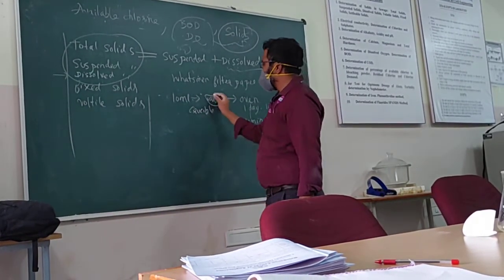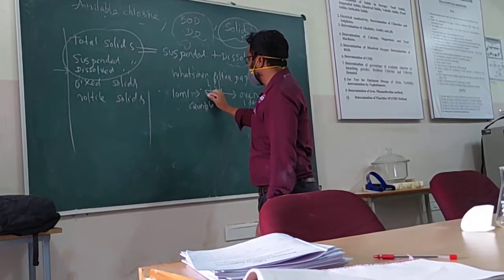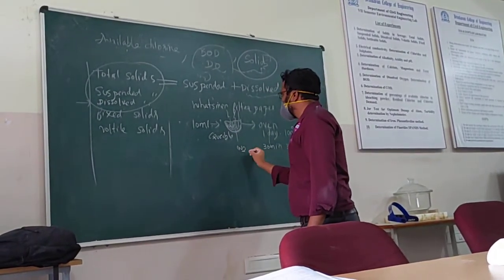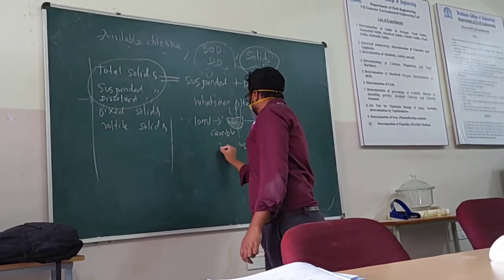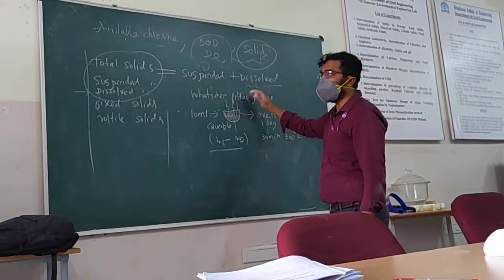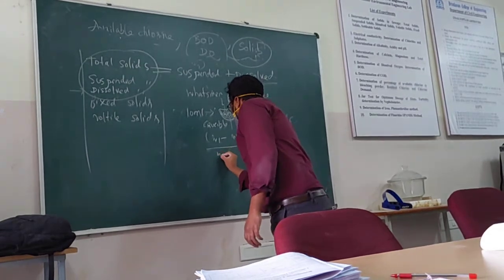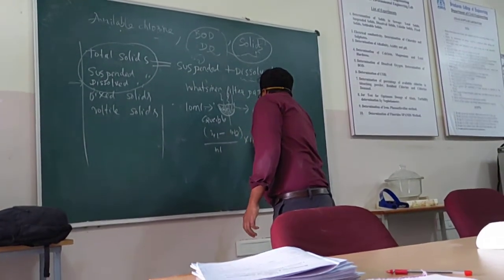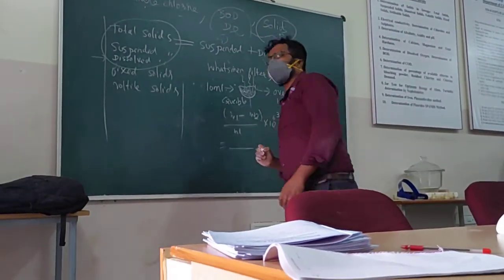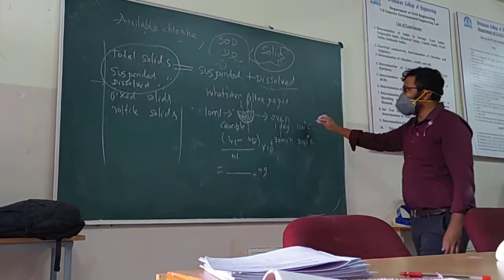Okay. So after this, all liquid evaporates. Whatever thing remains, we will take the weight. First we will take the initial weight of the crucible, and after that the final weight, after completely going through the evaporation process in the oven. We will divide by ml of sample taken and multiply by 10 raised to 6. If you do it, you will get how much solids are there, in mg per liter.